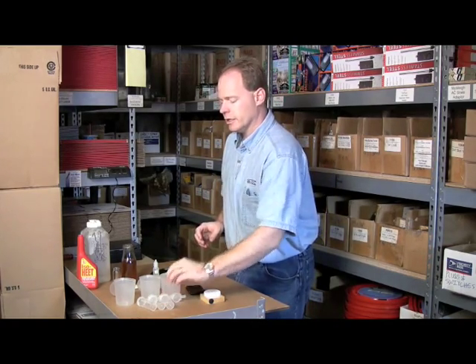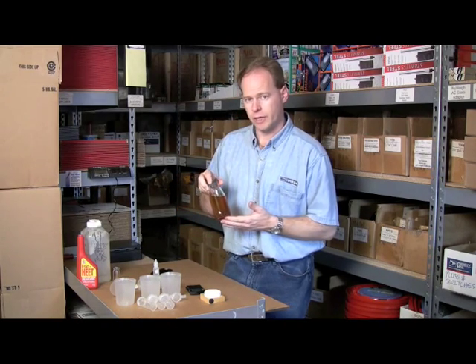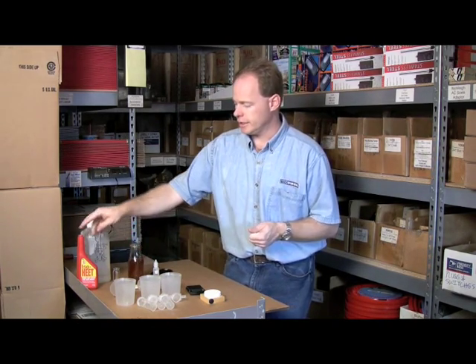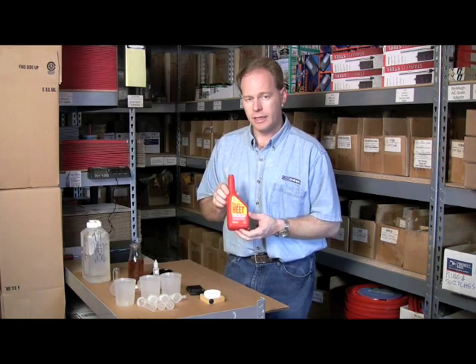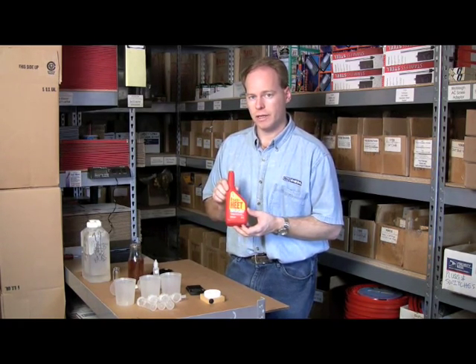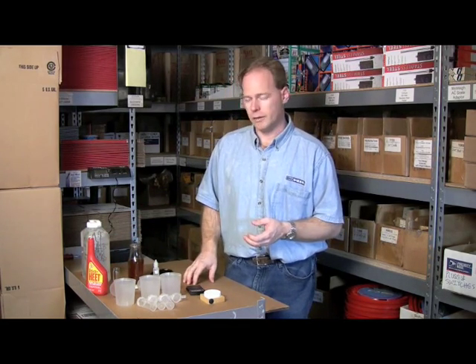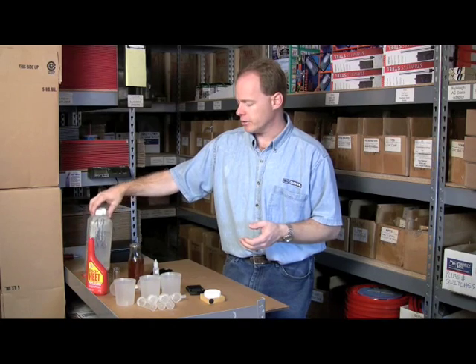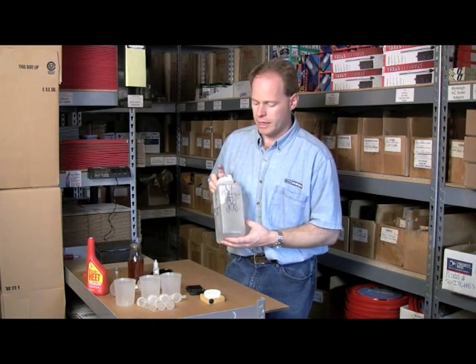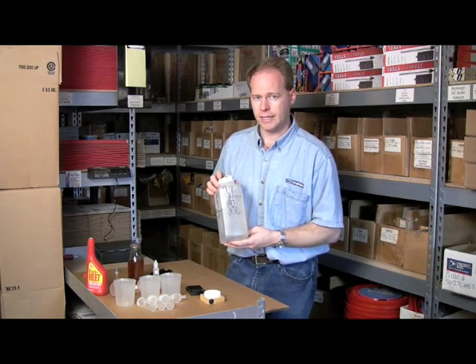To get started, you're going to need some oil — this is basic restaurant-grade used oil. You'll need some isopropyl alcohol, such as Iso-HEET from a local store, or isopropyl alcohol from a drugstore. You'll also need some distilled water in a container, and a little bit of catalyst — either sodium hydroxide or potassium hydroxide.